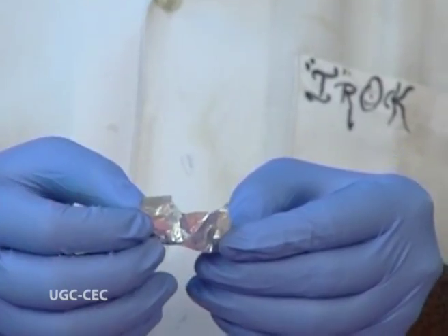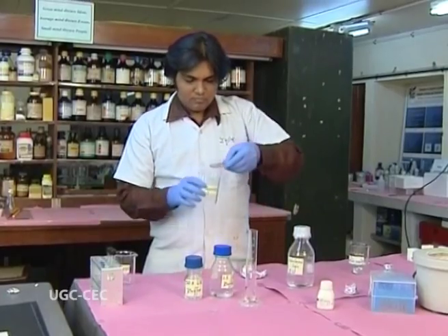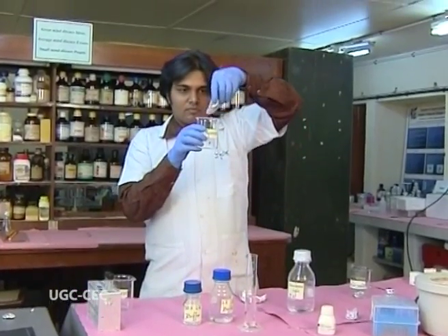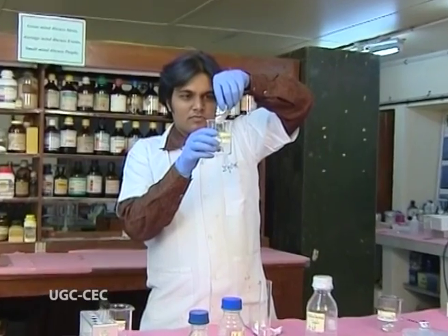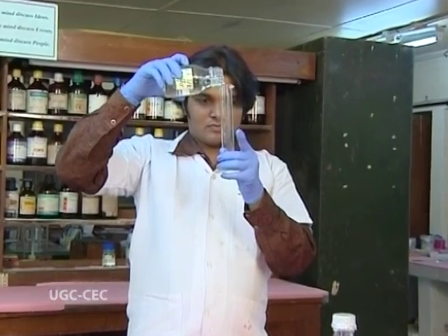Now the heart of the technique is the preparation of agarose gel. For only DNA checking, we need a less concentrated gel, hence 0.8% would be worth it. But if we are also loading PCR products, then we need to make a higher concentration gel so the separation is clear, and hence we take 1 gram of agarose powder and dissolve it in 1X TAE buffer, which I've already prepared a little bit ahead.